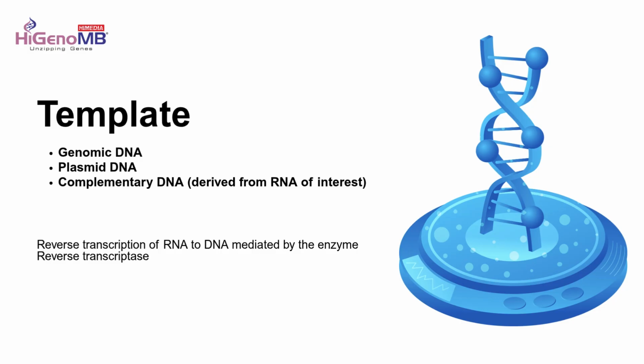That is genomic DNA. It can be from any source, human or virus or bacteria. Or the template can be a plasmid DNA, or the template can be a complementary DNA, which is generated as I explained now.